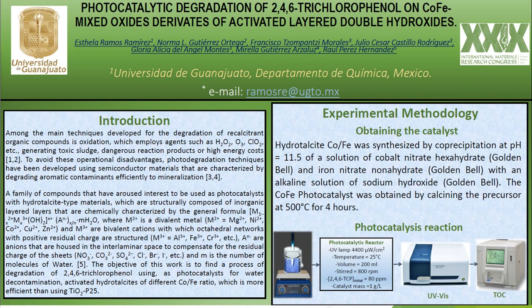Prior to UV irradiation, 200 milligrams of the catalyst was contacted with the standard 2,4,6-trichlorophenol solution for a period of 1 hour in the dark to verify an adsorption-desorption equilibrium of the contaminant molecule with the catalyst. Once the equilibrium has been reached, irradiation begins for a period of 3 hours. In addition, commercial titanium dioxide was used for comparison as a reference photocatalyst.